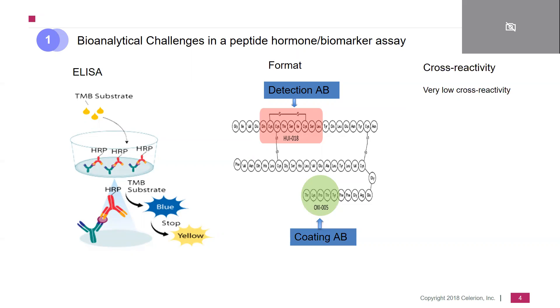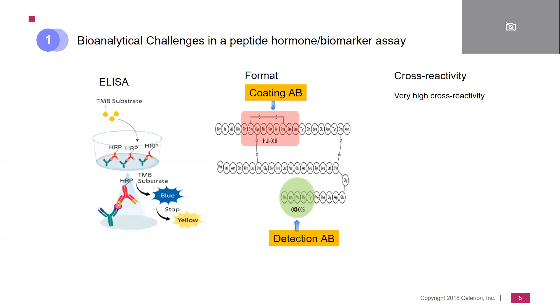This assay performed very, very well and had very low cross-reactivity towards all the other insulin analogues. Then what happened is we had to use another kit lot, and things changed. The ELISA format was obviously the same, but the only change was the swap of the detection with the coating antibody — and the provider had not informed us about that. All of a sudden, this assay showed a huge cross-reactivity and was no longer suitable for reliable detection of insulin.